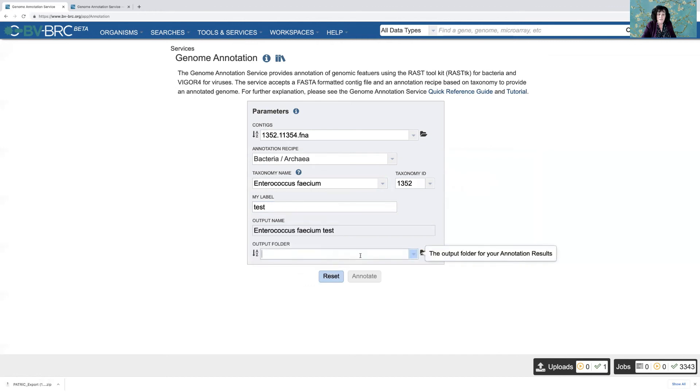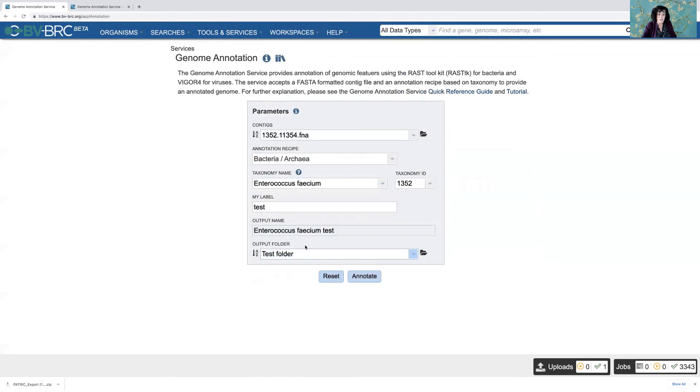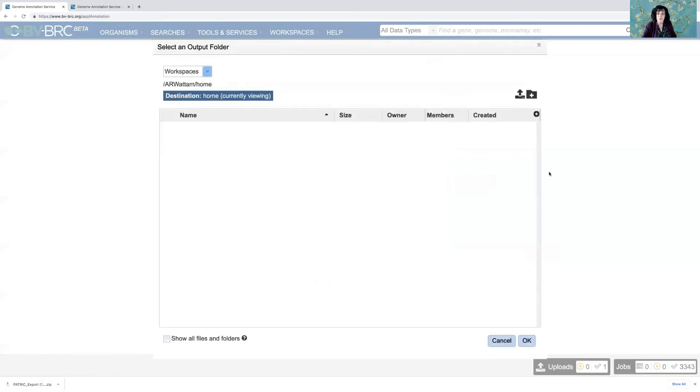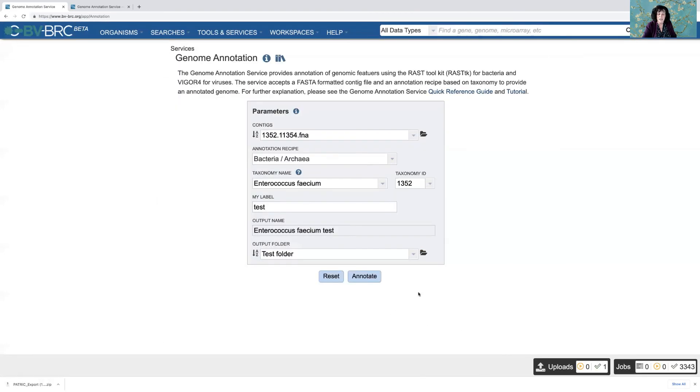But if I've done one before, I can either click down, that'll show me the most recent ones. Or I can start typing the name and get that. Or if worse comes to worst, I could create a new folder with a new name. But I don't want to do that.